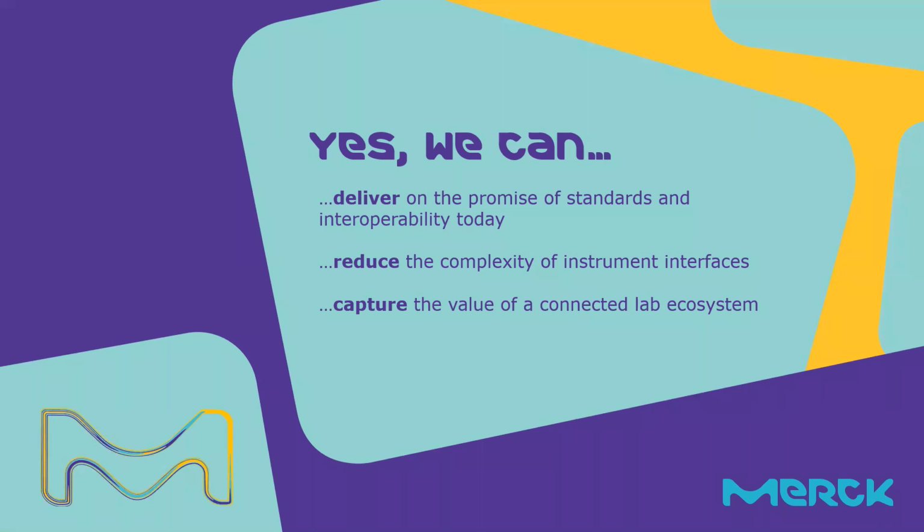So to summarize, I think we can say, yes, we can. And given the upcoming elections, or the current elections, we can. And what can we do? We can deliver on the promise of standards and interoperability today. We can reduce the complexity of instrument interfaces and capture the value of a connected lab ecosystem using things that are common sense and that are available off the shelf with minimal effort.